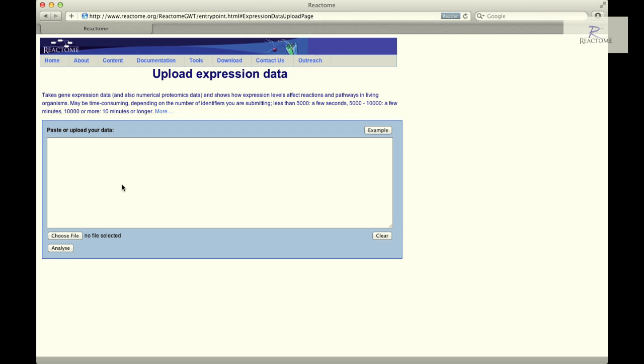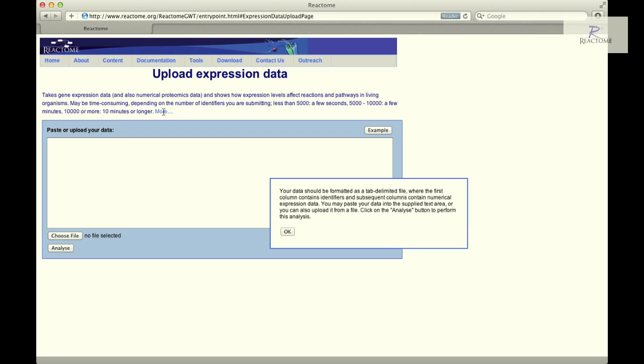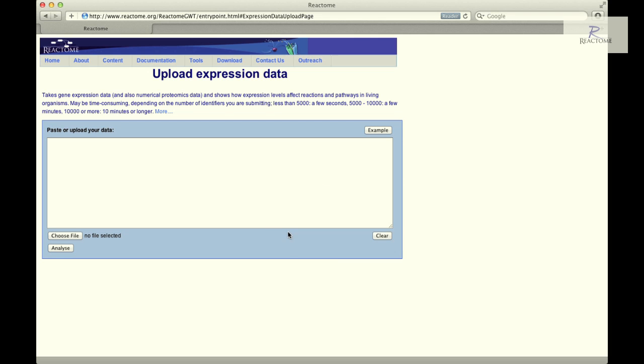The Expression Analysis Data entry page will accept numerous gene and protein names, database identifiers and accession numbers, and will support columns containing numerical values. For example, fold change expression data, abundance or statistical values. Data should be formatted as a tab-delimited file where the first column contains the identifiers and subsequent columns contain the numerical values.